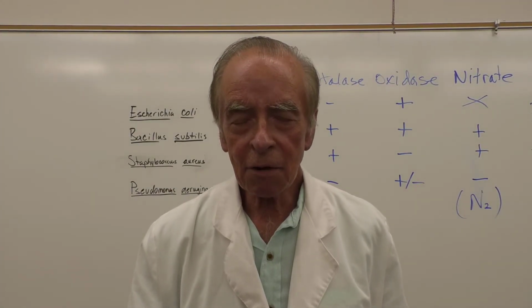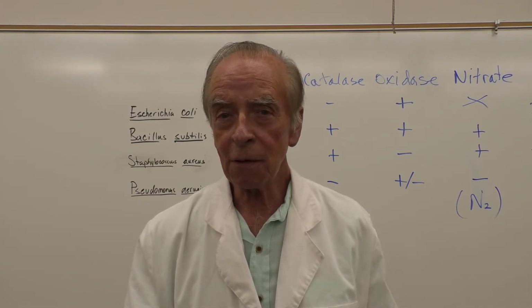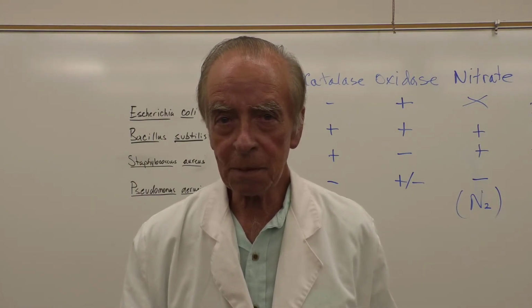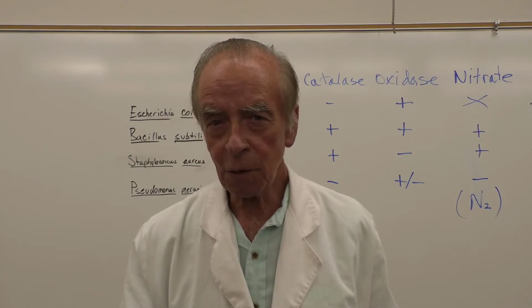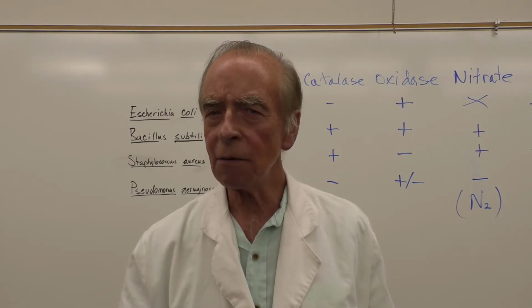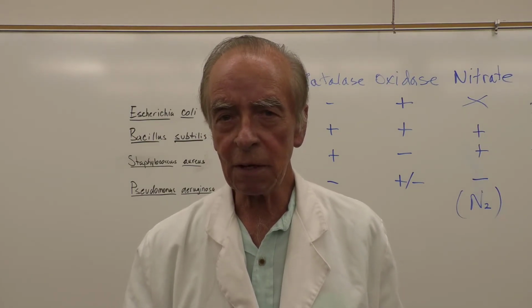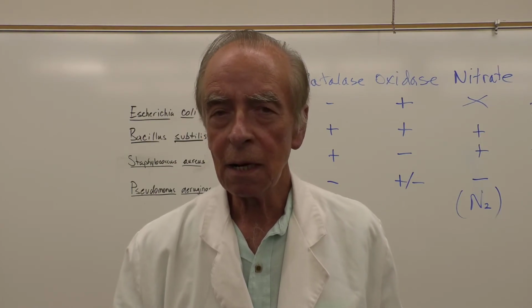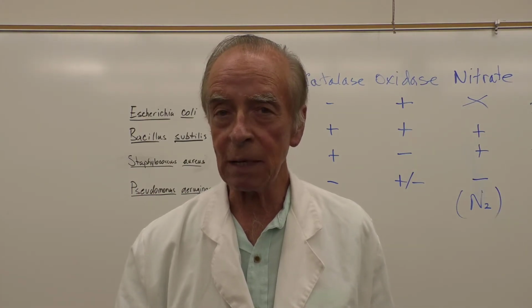Triple sugar iron agar has 3 sugars. It allows us to test for the fermentation of those sugars or a combination of those sugars being fermented. Also allows us to test for hydrogen sulfide production. So there's a lot of information that you can gain. In clinical laboratories, this is one of the old media that have been around for 50 years or more and is still popular in clinical laboratories because it yields so much information.